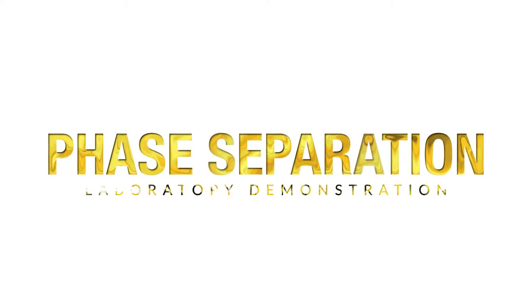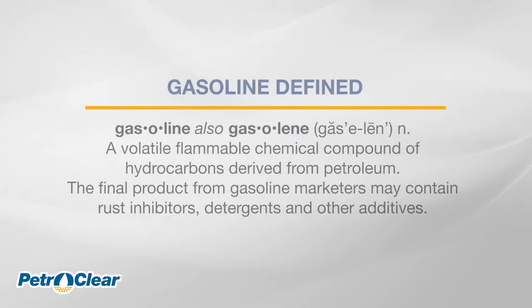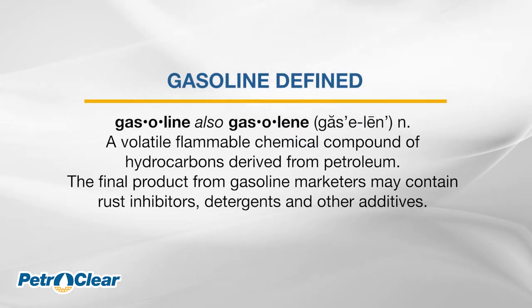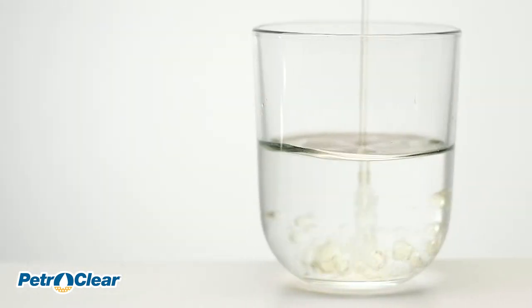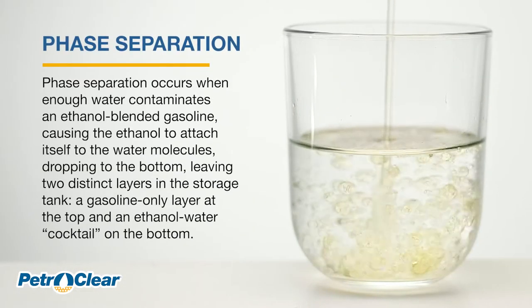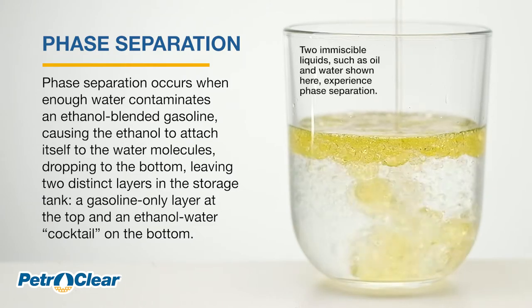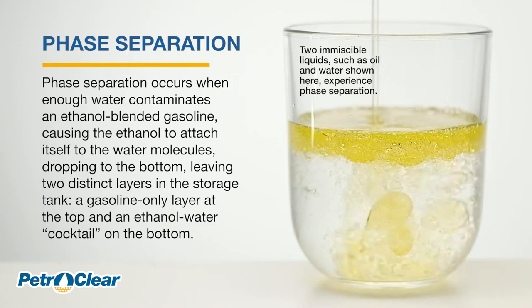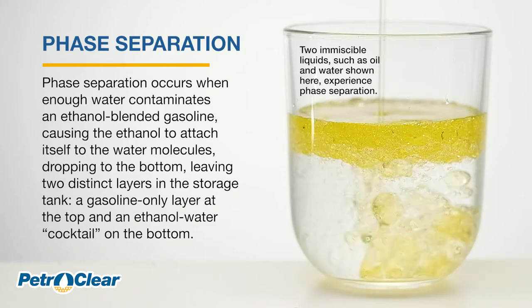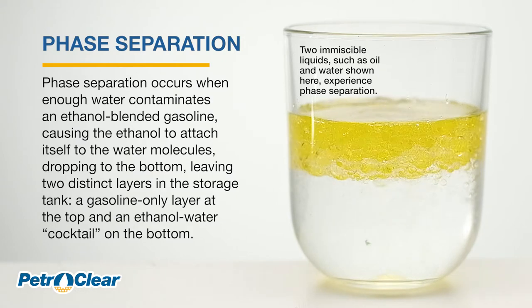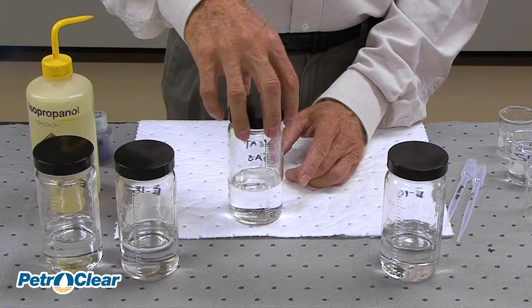The following is a laboratory demonstration of the difference between water in gasoline and water in an ethanol blended gasoline. We will also demonstrate how phase separation takes place. Phase separation occurs when enough water contaminates an ethanol blended gasoline, causing the ethanol to attach itself to the water molecules, dropping to the bottom and leaving two distinct layers in the storage tank: a gasoline only layer at the top and an ethanol water cocktail on the bottom.